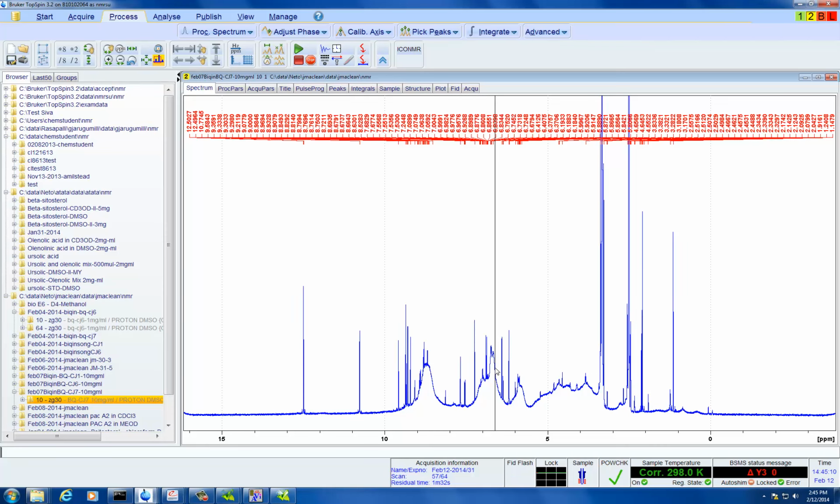But if you use another compound, like caffeine, and you quantify that, you can save that information, and then any other sample that you have, you can quantify any compound in there. So that's one thing you would need to consider.